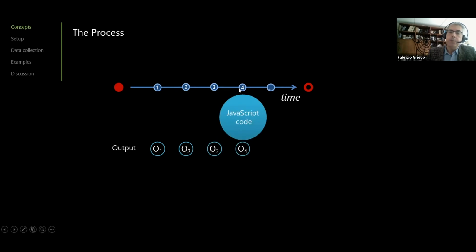What happens if one of these samples is missing? Well, in the JavaScript code, you have to make sure that there must be some condition that if for instance, the body point is missing for some reason, then the output will be missing as well. So there's a way to instruct EthoVision, if you don't find the body points or whatever, then the output will be set to missing.